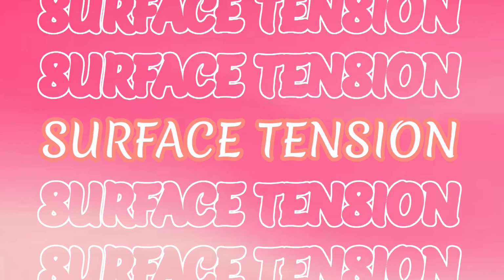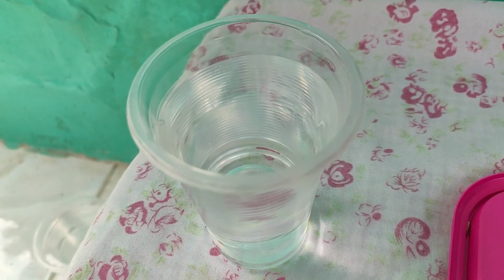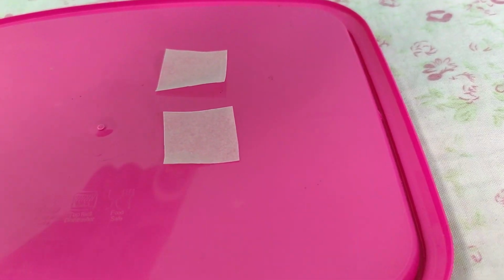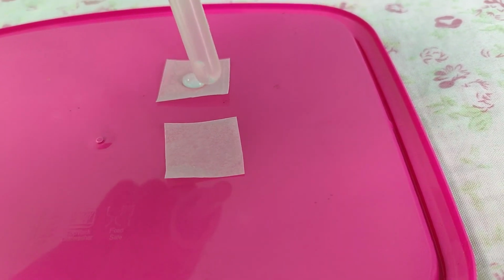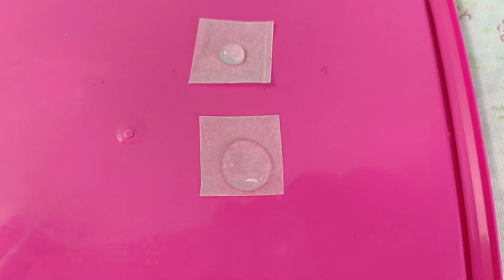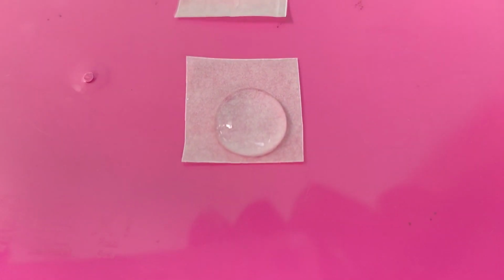And now for the second experiment, which is the surface tension. Here, there is a wax paper and water. I put a drop of water on the wax paper, and my observation is the wax paper does not absorb the water, and the drop of water creates a little round shape on the wax paper.